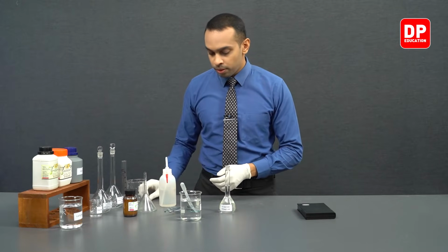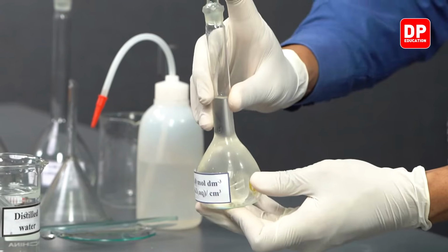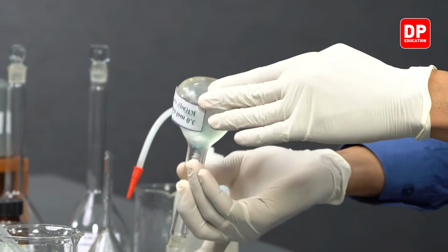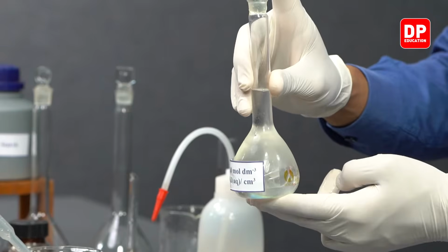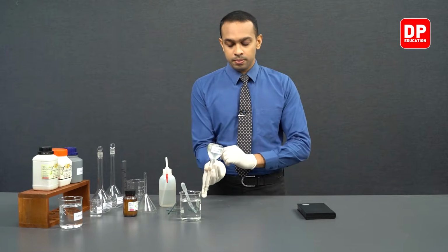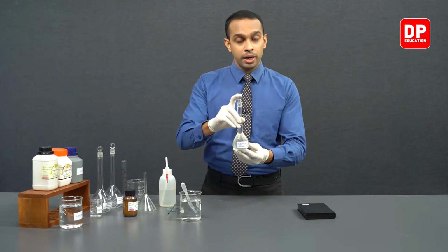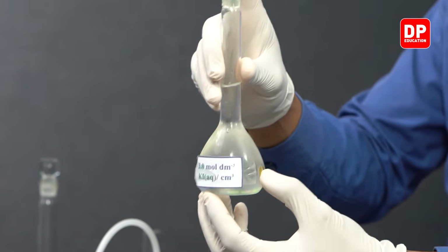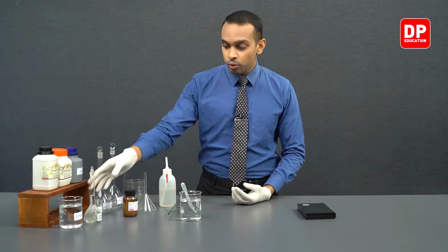Now students, we will place the stopper and close it tightly. After placing the stopper, you can turn it upside down a few times like so to make sure the solution is completely mixed. Now students, we have prepared a potassium iodide solution with 3.0 moles per decimeter cubed concentration. So we can set it aside, and now we can move on to the next solution.